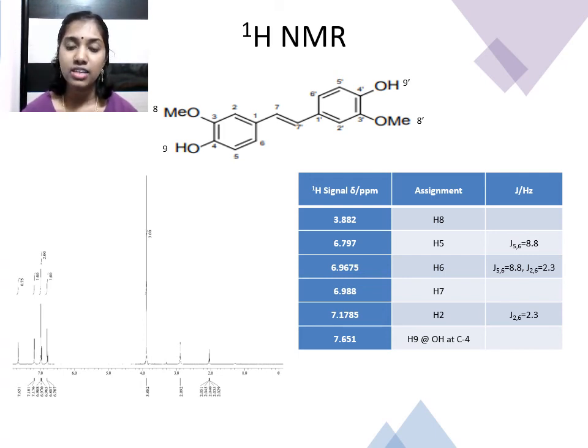In an aromatic ring, coupling usually occurs beyond the adjacent carbon atom. The ring hydrogens, which are chemically as well as magnetically non-equivalent, interact with one another to produce a spin-spin splitting pattern. The extent of interaction depends on the distance between them. The closer the proton is to the other hydrogen atom, the greater the effect on the proton. For the ortho position of the benzene ring, the coupling J value will be higher if a hydrogen atom is present. Ortho hydrogens couple more strongly than meta hydrogens.